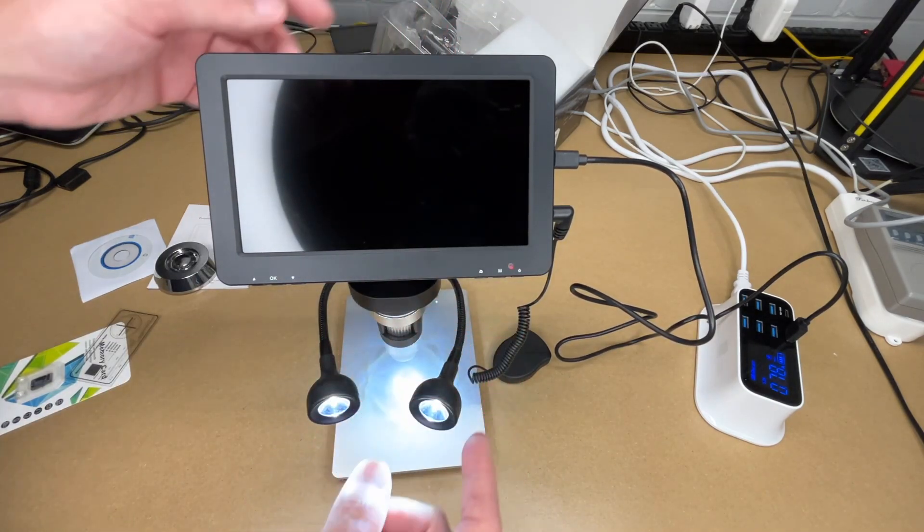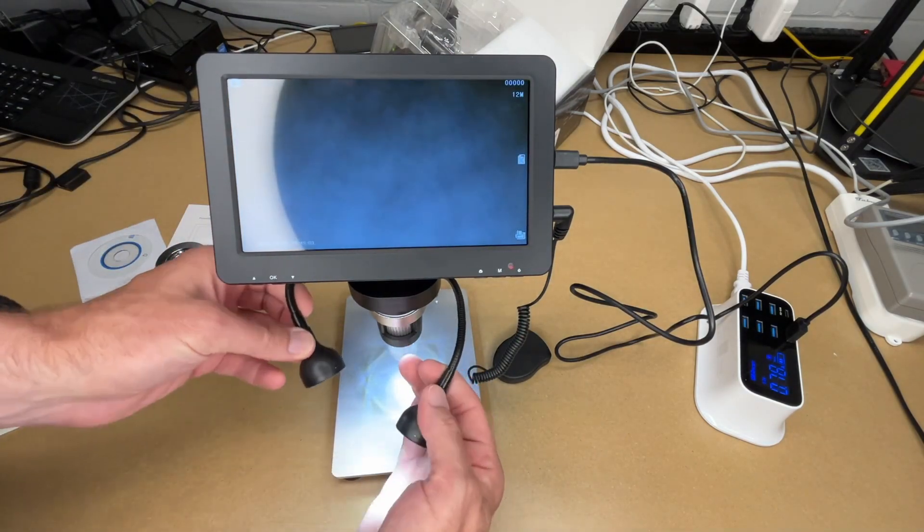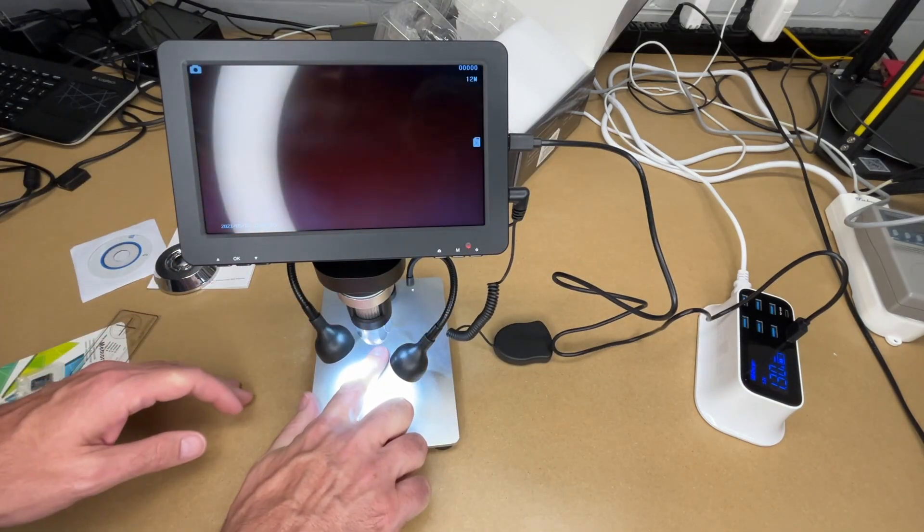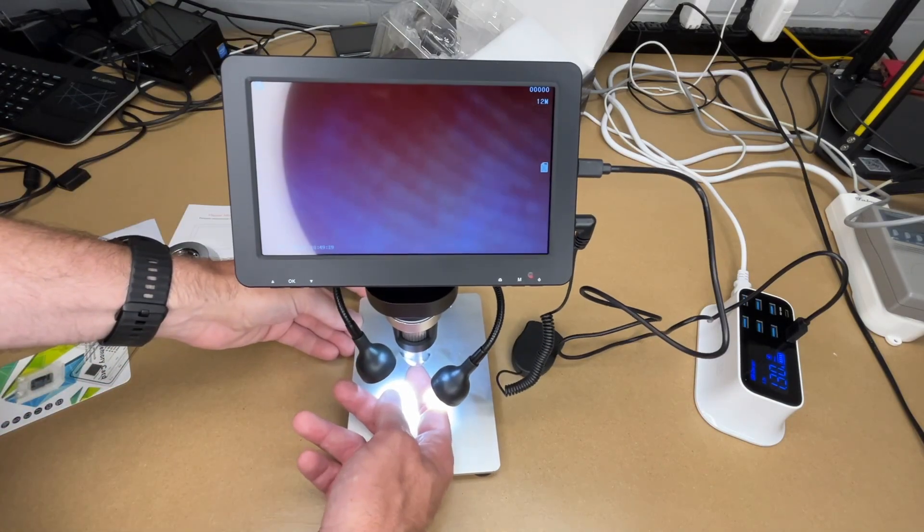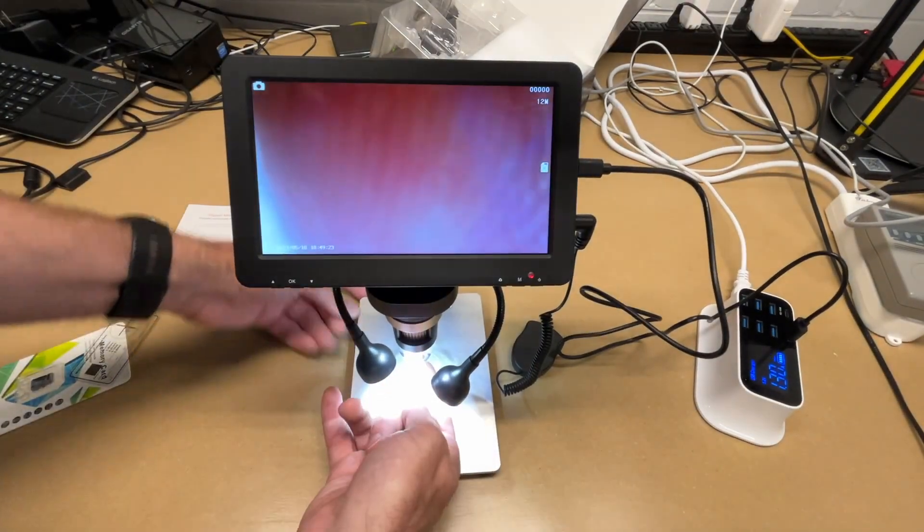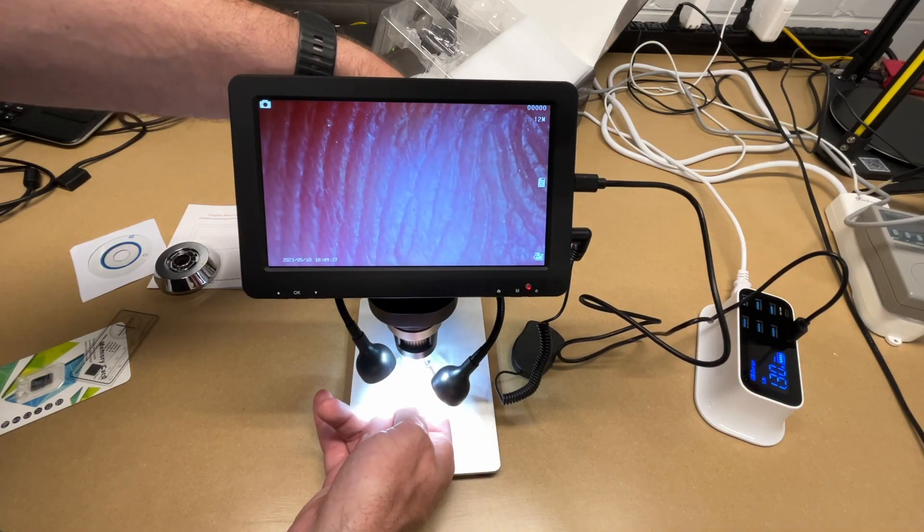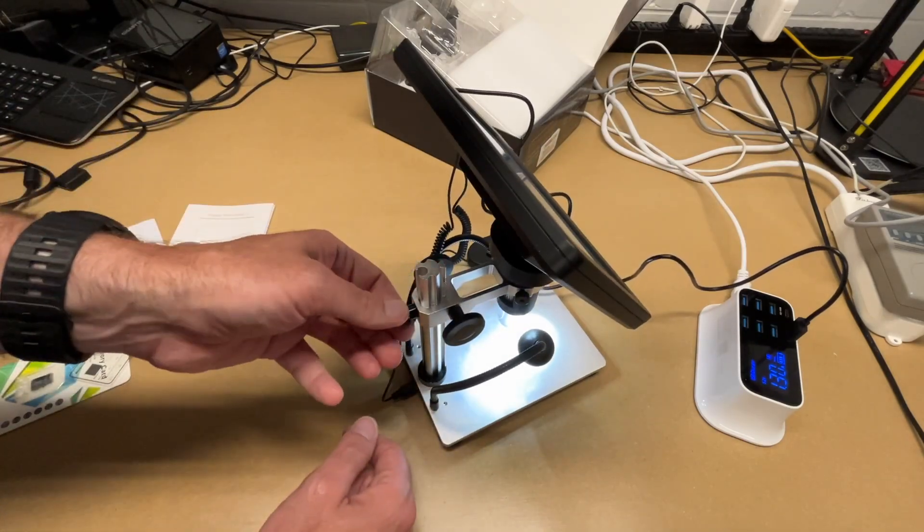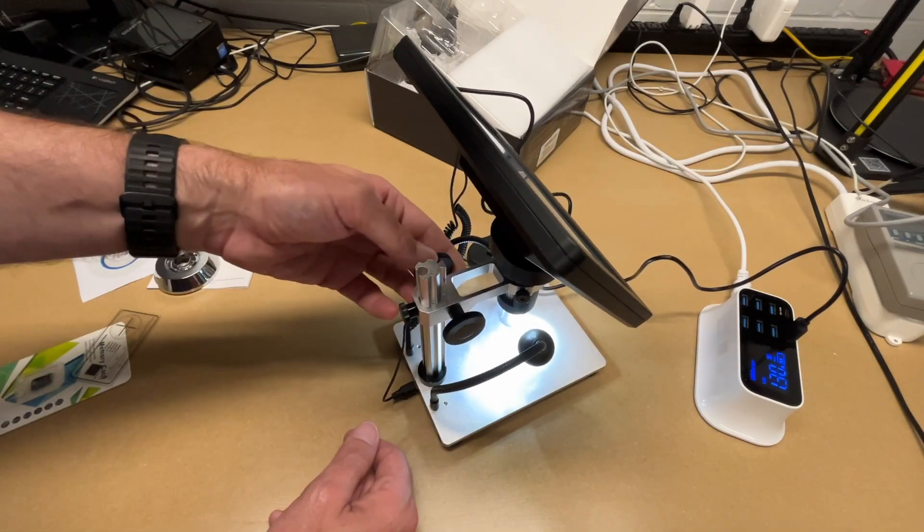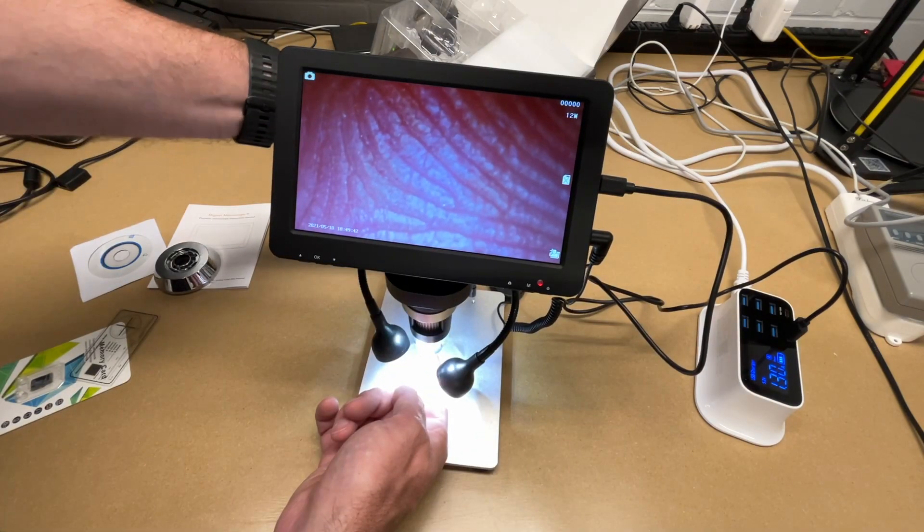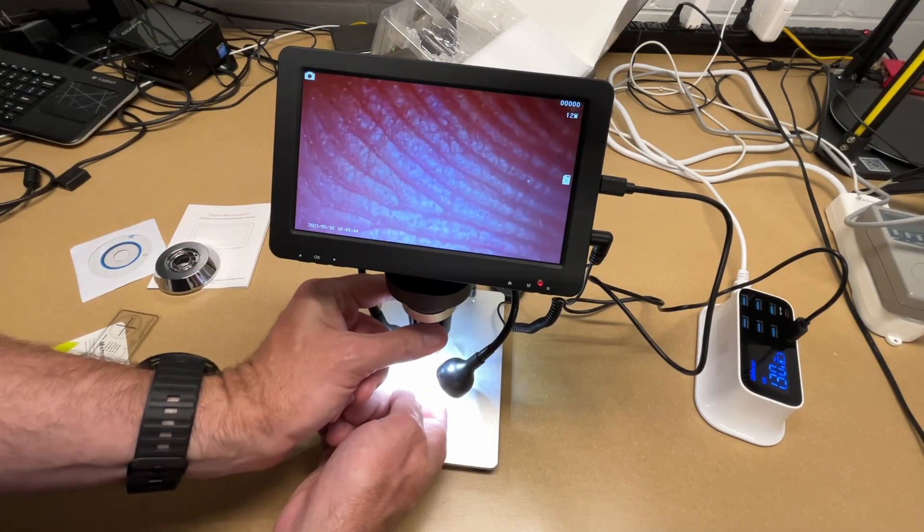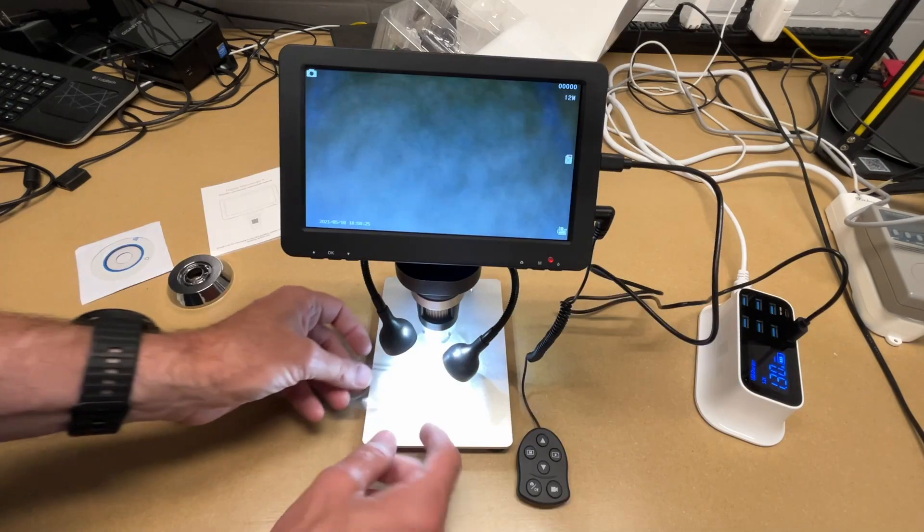Hold the power down to turn it on. So you can see the light's turned on. So these are very bright. So it looks like it is working now. So I'll put my finger under here. I'll do a quick demonstration. I'll turn my light off. So I have my finger under here. And I can lower this down. That's kind of a large adjustment. So I'm turning this here. I'll loosen this up. I can move this to get it close. And then I'll tighten this down. I'll tighten it down in the back. And then I can use this on the front to do a more fine adjustment.